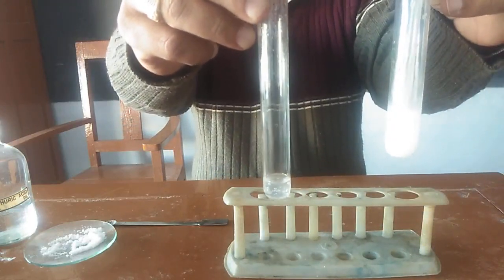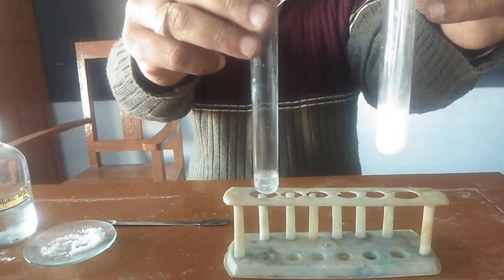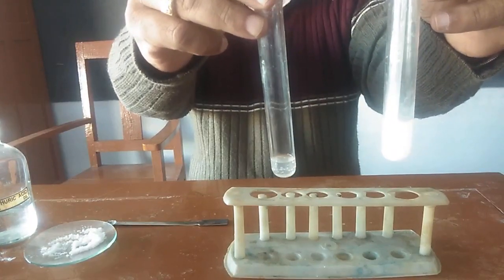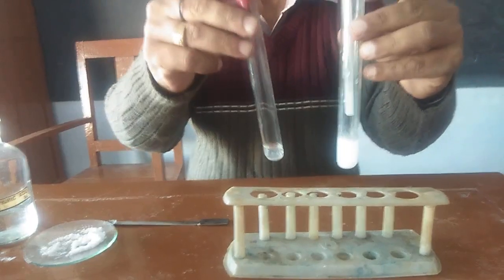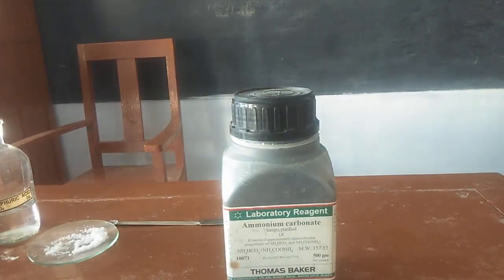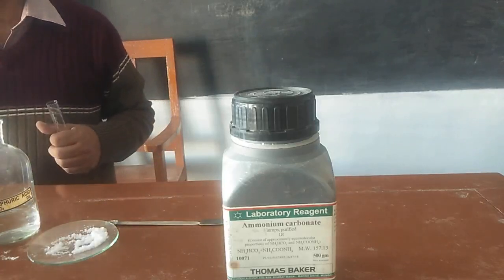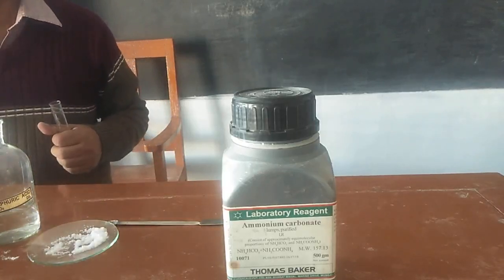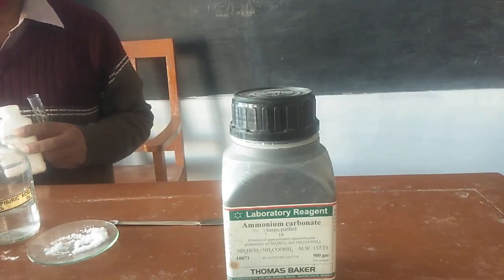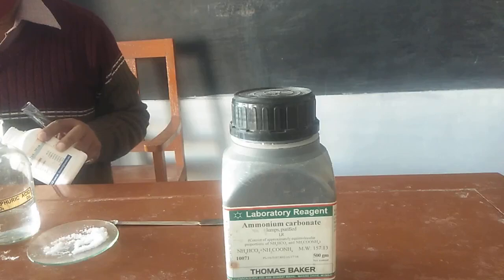Now, if we pass this carbon dioxide gas in excess, the milkiness of the lime water will disappear, due to the formation of calcium bicarbonate. So, the preliminary test of carbonate ions can be done with the help of dilute H2SO4, and the confirmatory test is done with lime water. You have seen how lime water turned milky when we were passing carbon dioxide gas through it. So, this is also a test to detect the presence of carbon dioxide gas.